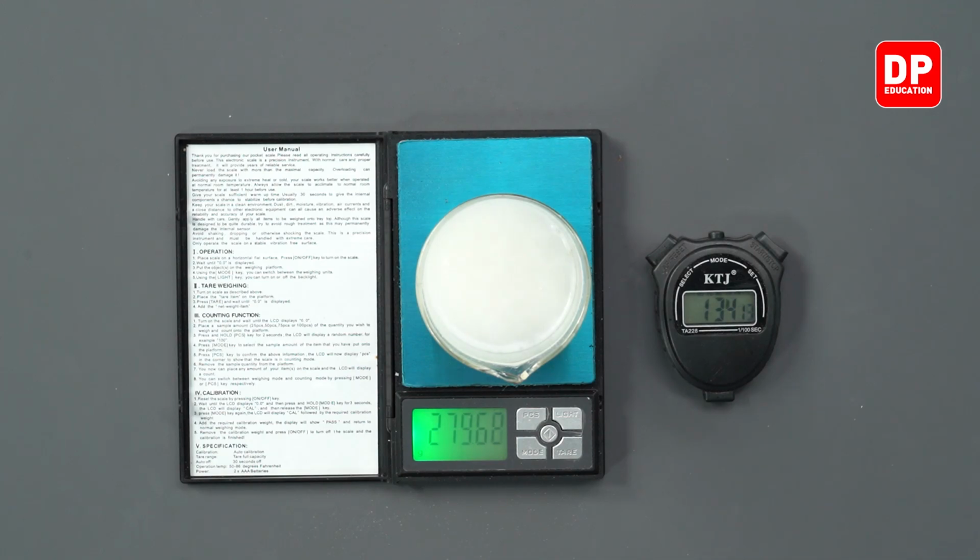Our fifth reading is going to be 279.62 grams. Our sixth reading is coming up next, and that will be 279.46 grams.